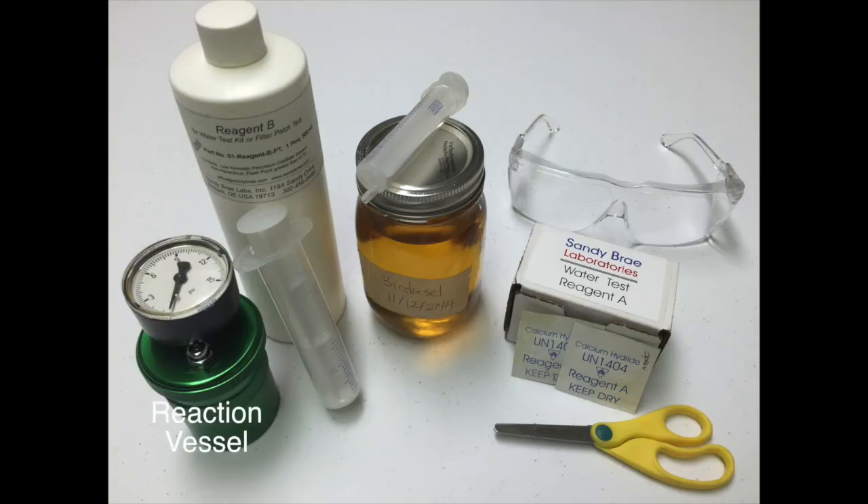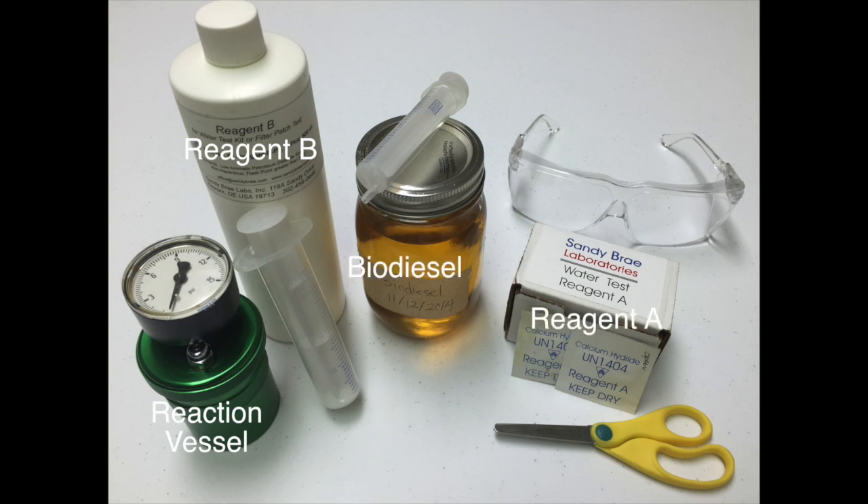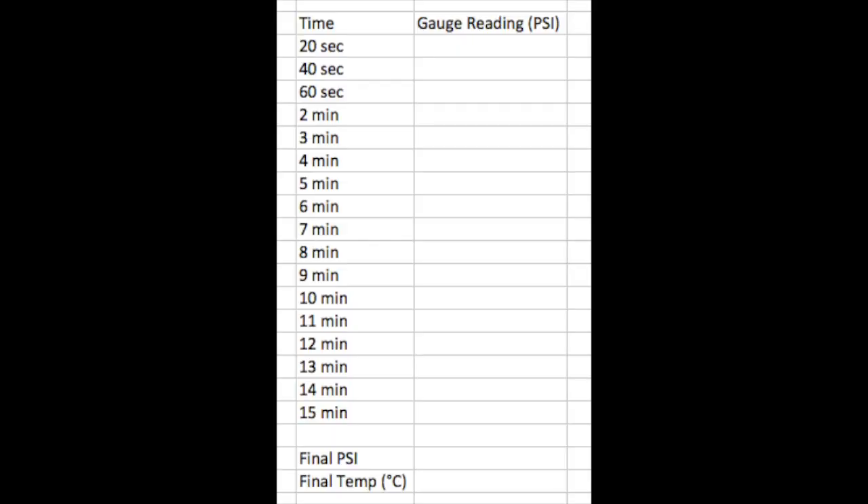For this experiment, you will need the reaction vessel, reagent B, biodiesel, reagent A, syringes, scissors, and goggles. Also have a notebook ready with a table so that you will be able to record your values once the reaction begins.